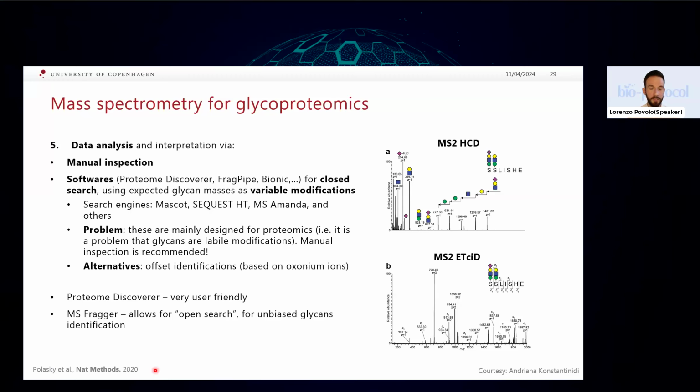Of course, what Katarina suggests is to use the calculator, so trying to understand the composition by hand. That was partly a joke, but I often use only the calculator. But there are also tools like Glycomod, and even GlycoWorkbench, that help with the analysis of unknown glycan compositions. Absolutely. So that's what I would suggest. Okay, shall we move on to the next questions? We have a few more.